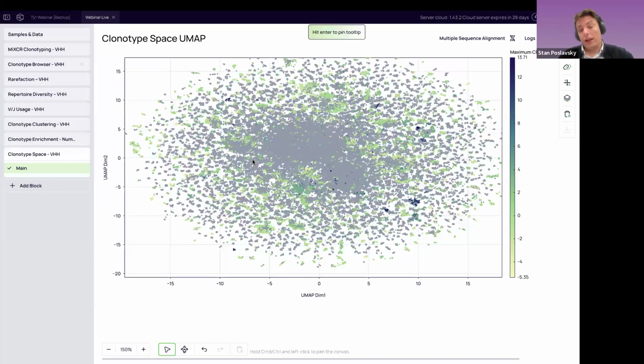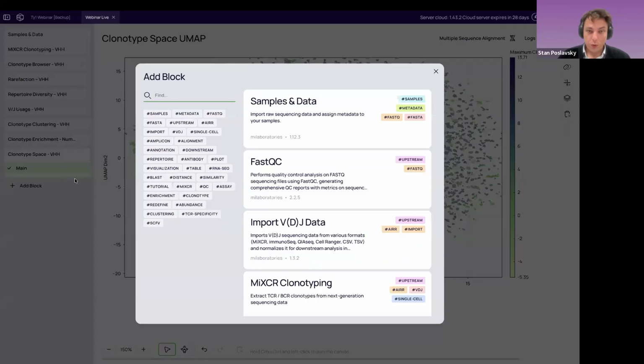But before that, let's do two more things. If we have assay data for some of the candidates that we already tested, we can import this data and it will help us navigate the further down selection. For this specific study, the nanobody is already reported. We know it, and there are functional properties of this nanobody.